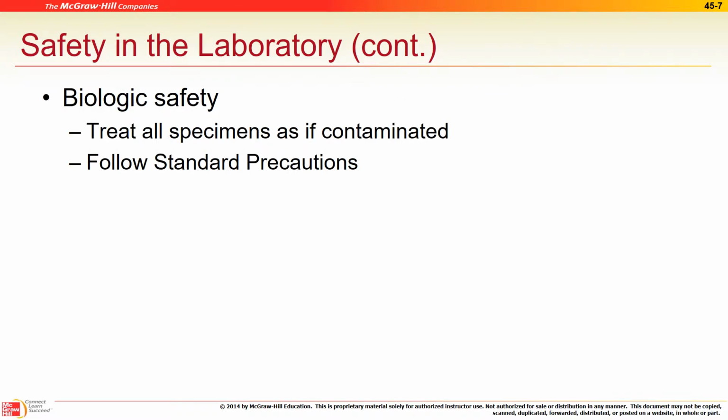It's not that I don't trust you, it's just that I don't trust anybody. So same thing with specimens. Just treat them as if they're contaminated. And even the outside of the container, I'd even wear gloves if I'm handling the outside of the container.